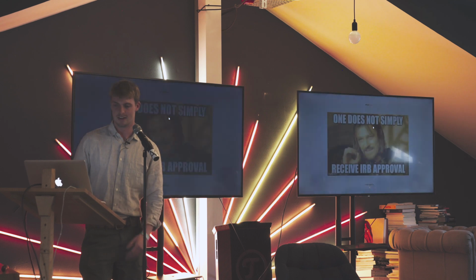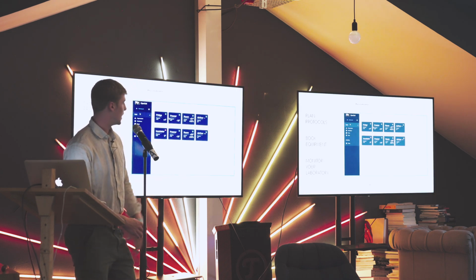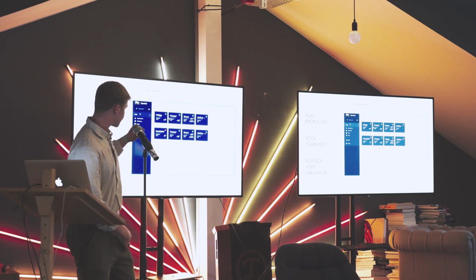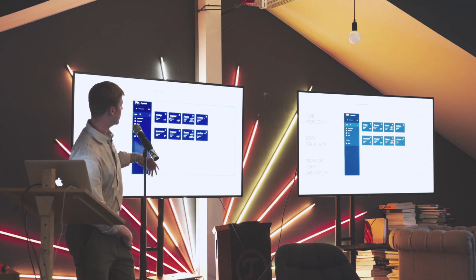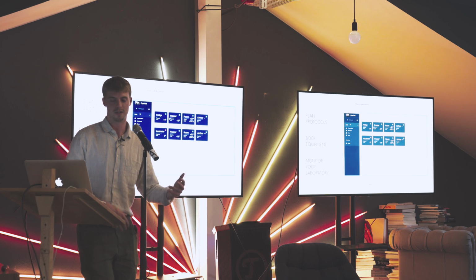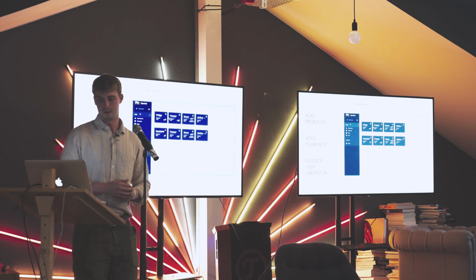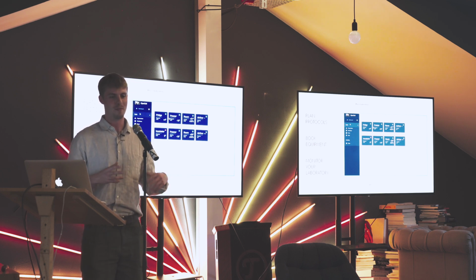So yes, this is a little look at this laboratory management system as it is at the moment. You can see there are fridges, freezers, and all of these background monitoring systems, as well as some active ones. For instance, you want to know an autoclave has gone up to the correct temperature and all of that sort of stuff.